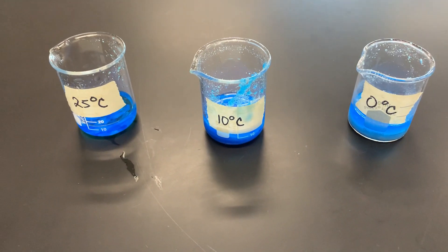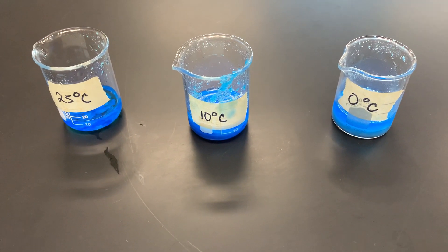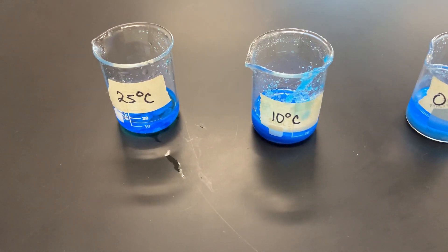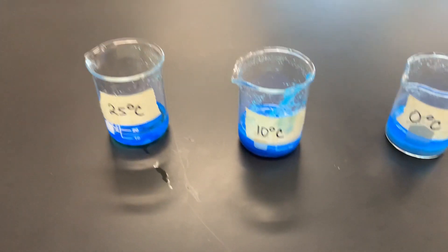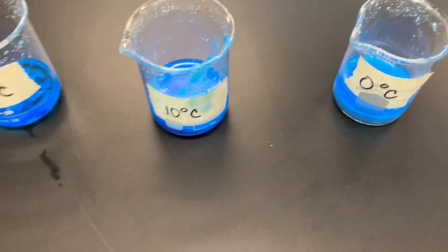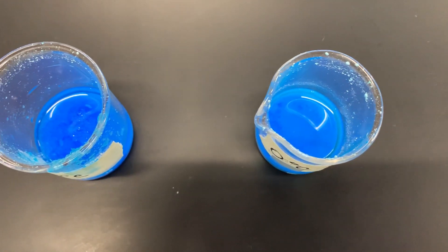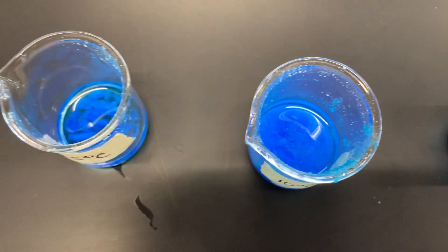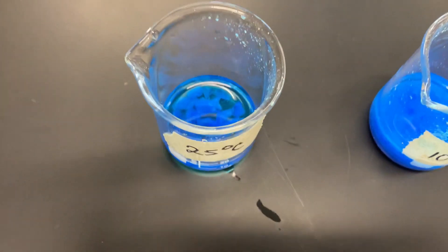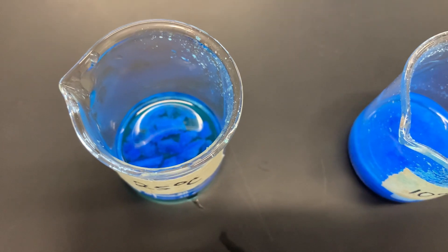You're looking at three small beakers. The one on the right is labeled zero degrees Celsius, which is about freezing; 10 degrees, which is refrigerator temperature; and 25 degrees Celsius, which is room temperature. In them you're going to see some copper sulfate, which is the blue solution, and some crystals. These were all the same solution — I poured them into three different beakers and cooled them at three different temperatures.